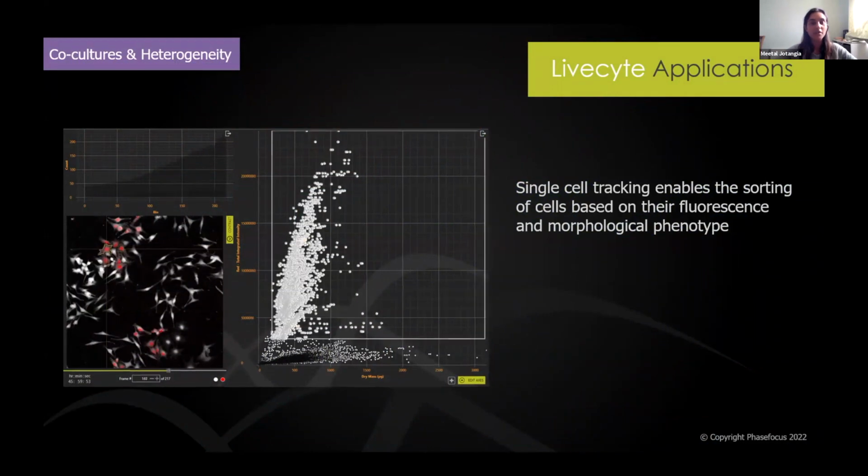So here, for example, we're able to capture just the cells which are fluorescent within that population of cells, and then do analysis on those separately. So we could also incorporate that into the dashboards, for example, and look at cells which are in and out of the gate, or you can also export that to do your own analysis.